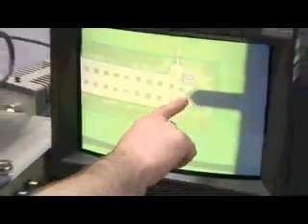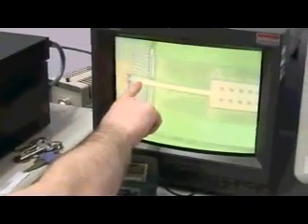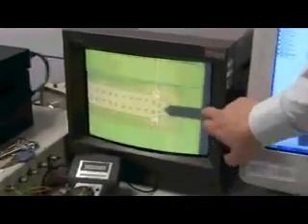So Greg's actually working on a project with the National Physical Laboratory, where Greg is designing a new type of probe, the needle that I was just talking about, and trying to design one that's better for the kind of work that we do. So this is a collaboration between us and physical sciences, which is something we like to do. Actually, this scale is pretty, not that small. This is just an optical camera. Okay. But this needle that Greg was talking about, this has the very sharp nano needle behind it.